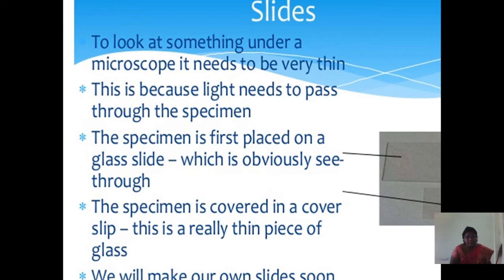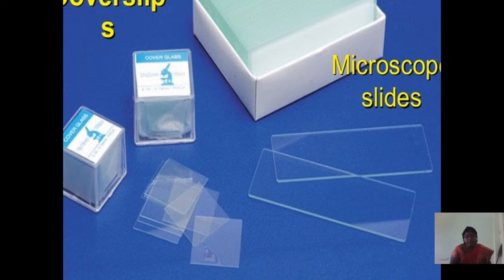The specimen is first placed on a glass slide which is obviously seen through. The specimen is then covered with a coverslip, which is a really thin piece of glass. We will make our own slides. This is the coverslip and this is the microscope slide.